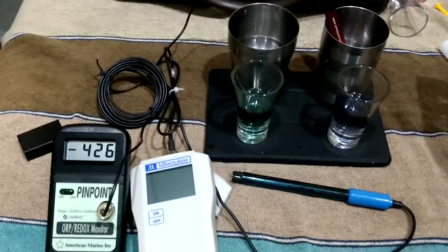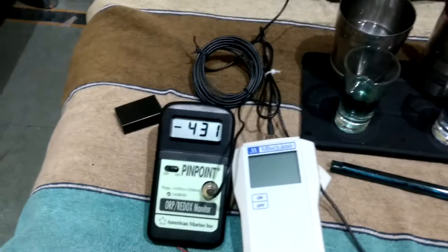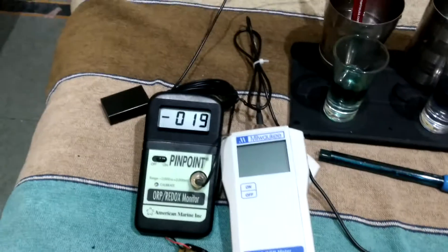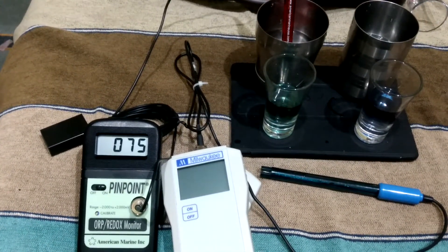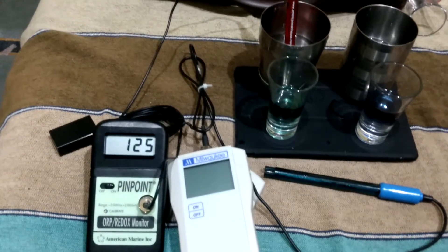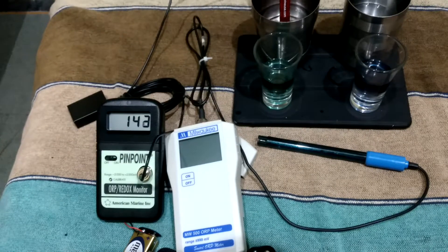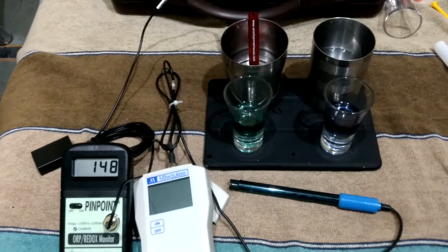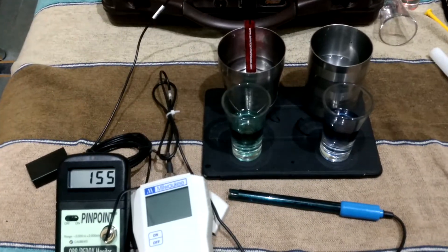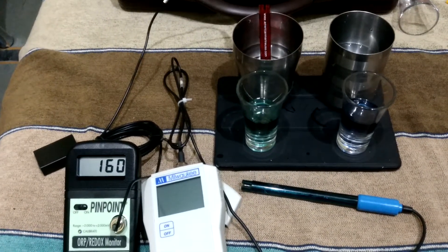It looks like both speed is fast and increasing. Now I will check my tap water. This is faster than Milwaukee. Going upside, approximately 150 to 200 ORP for fresh bore water. It is fresh bore water at 160.